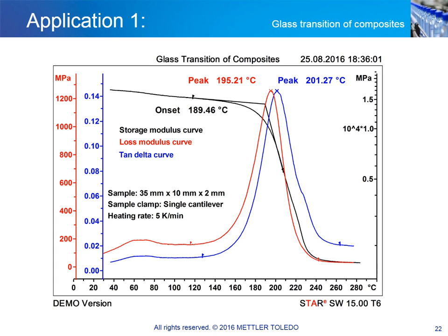The most prominent effect is the glass transition at about 190 degrees Celsius, and the temperature can be used as a measure of the state of cure, higher temperatures indicating a greater degree of cure. For engineering applications, for example aircraft wing components, the composite material cannot be used at temperatures above the indicated onset, after which the modulus drops rapidly.